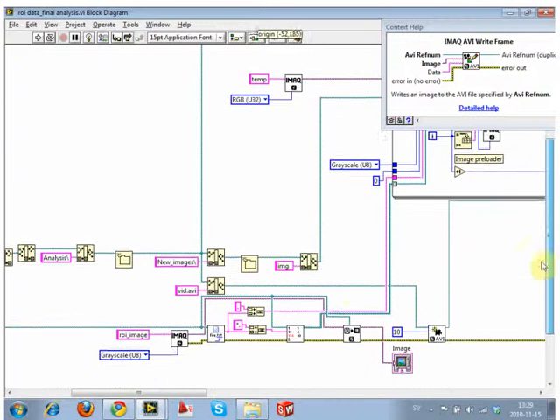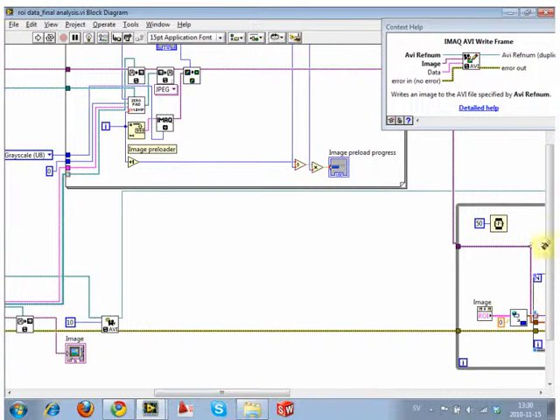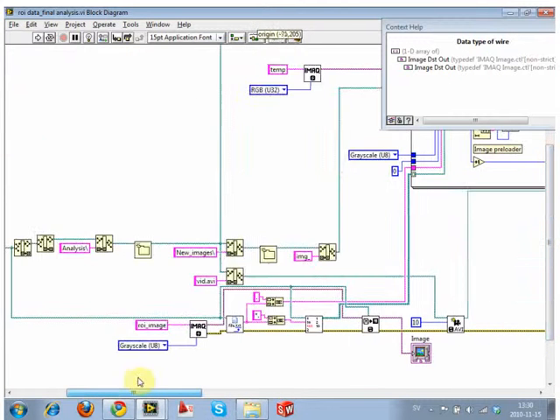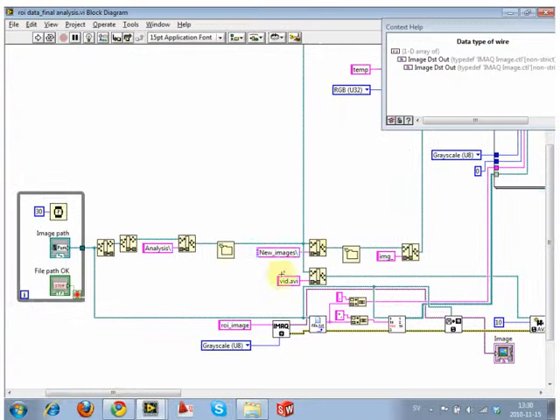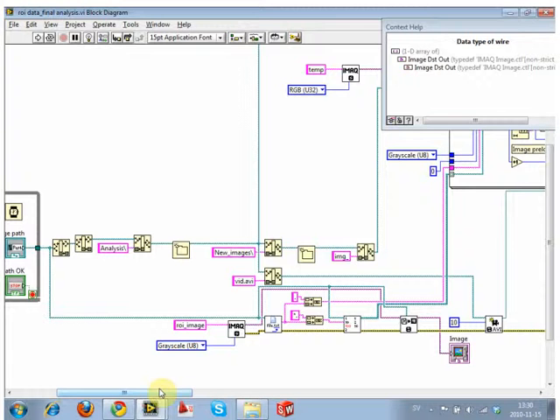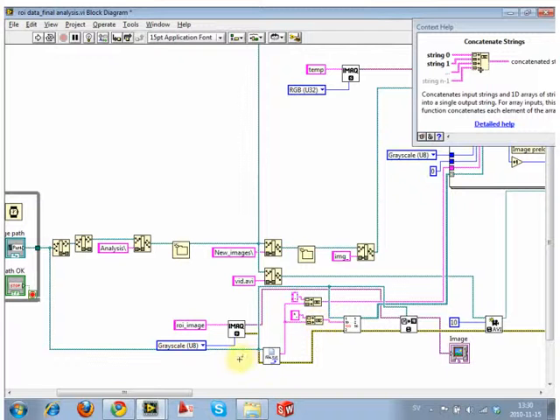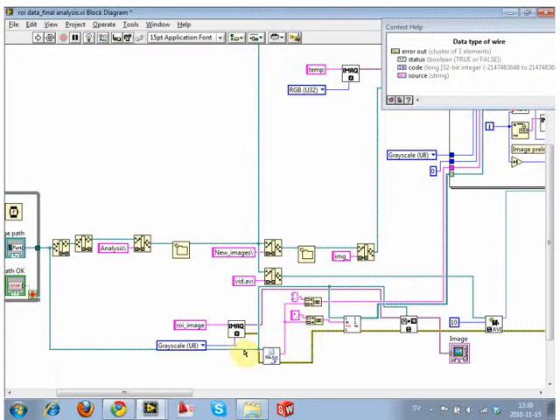Okay, let's destroy a massive chunk of this VI and then we'll rebuild it. Probably one of the hardest things to get around is this file naming situation. So I can go through this. What I'm going to do first is rebuild this pathway so that we can see exactly where this comes from, why we use it with these guys, etc. So let me start deleting.